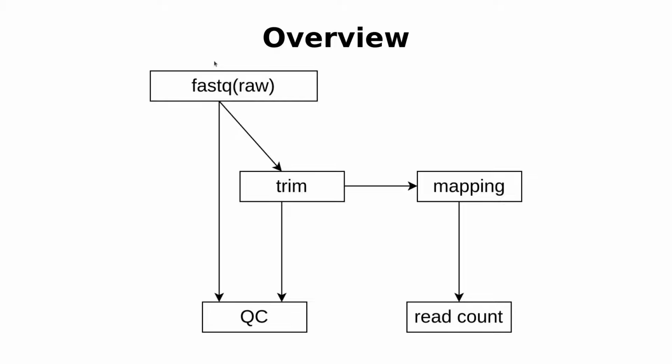We are first going to get our example data sets. We are going to use fastq files. These are paired end reads. Of course, we will deal with multiple samples. Then we are going to trim the reads, and then after trimming the reads, both the raw reads and the trimmed reads, we are going to run QC on them. Okay, we are going to use fastqc to do this. So the essence or the point is to compare and then note if there was an improvement in the trimmed reads, okay, compared to the raw reads.